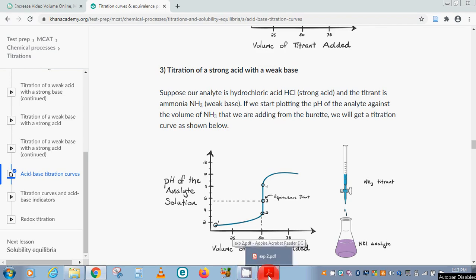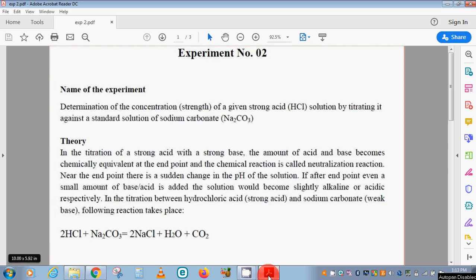Hello everyone. This is your course instructor B.S. Vintek Kamal and today we are going to talk about a titration experiment. This time we are going to talk about a strong acid and a weak base. We have to determine the concentration or the strength of a strong acid, that is hydrochloric acid, and we are going to titrate it against the standard solution of sodium carbonate.